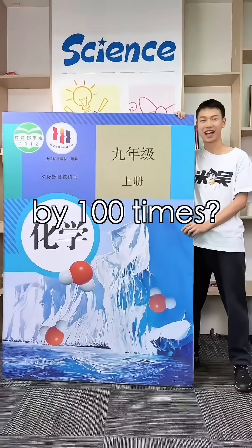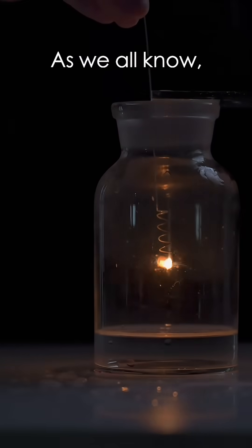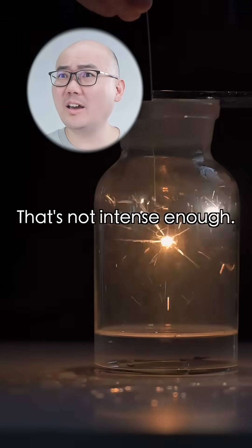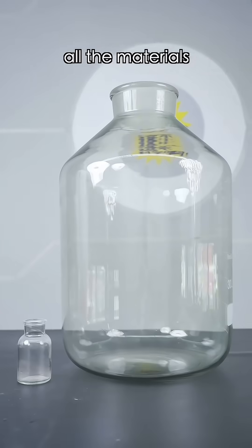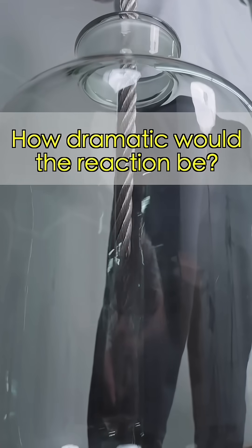What if we scale up a textbook experiment by a hundred times? We'll try burning iron wire in oxygen. As we all know, iron wire burns vigorously in oxygen, sparking intensely. But that's not intense enough! What if we scale up all the materials by a hundred times and replace the thin iron wire with a thick steel cable? How dramatic would the reaction be?